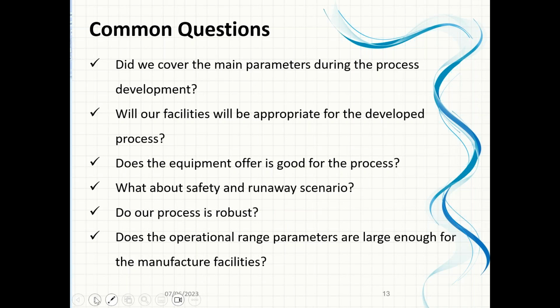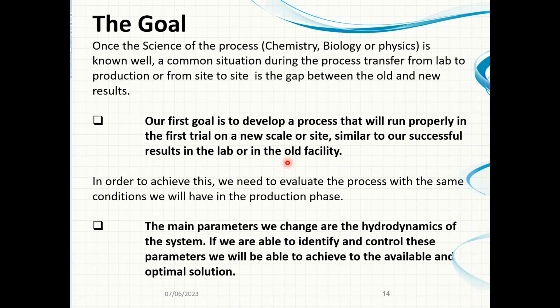And when we evaluate it, we know that the main change comes because we are changing the size or the geometry, and this directly influences the connection between fluid elements, so the connection between the materials in our tank. A slight deviation from this interaction between fluid elements in the tank can generate different results in design, operation, purity and quality. And it's our mission to answer the question.